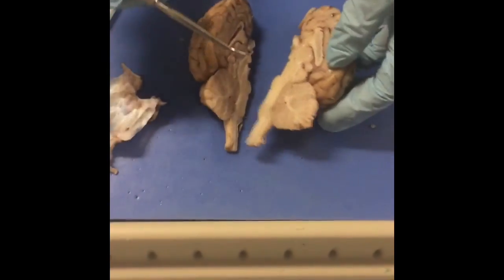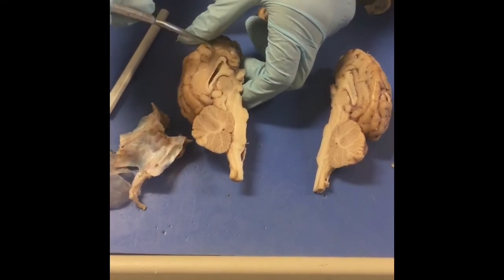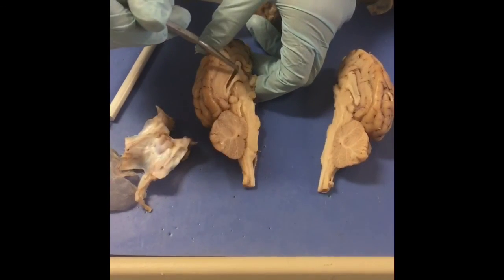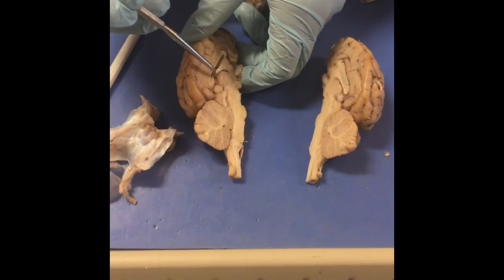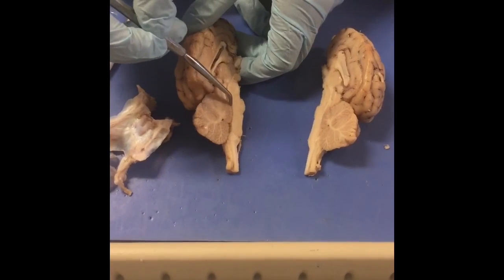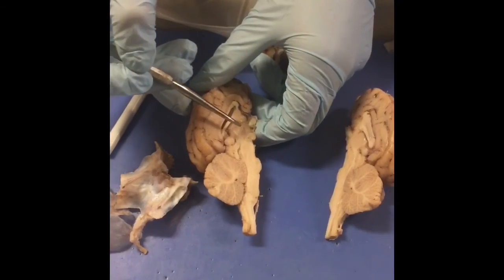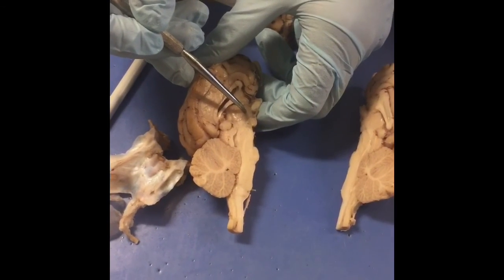And then on the internal structures of the brain, we have the corpus callosum. And then on either side of the brain, we have the lateral ventricles, which make the first and second ventricles. And then below that, we have the fornix. And then we have the third ventricle right here and the fourth one down here. And then we have the pineal gland right here. And then the thalamus is this little circle right here. And right below that, we have the hypothalamus.